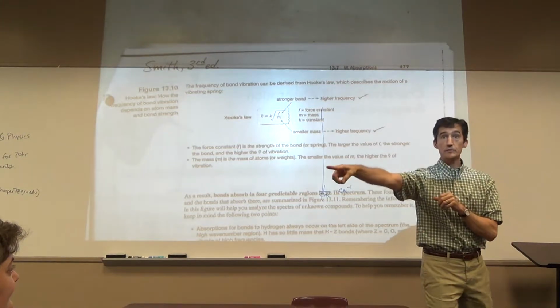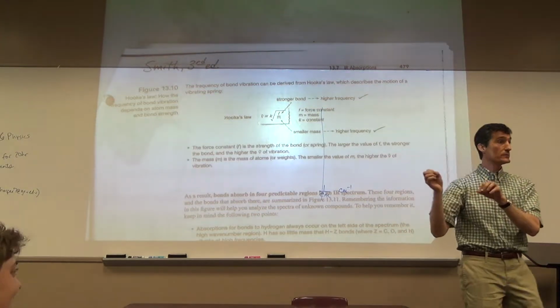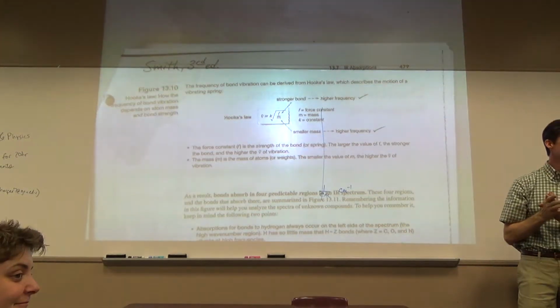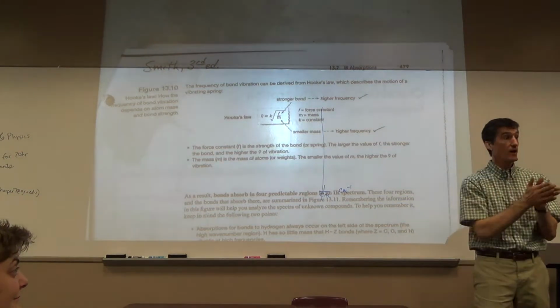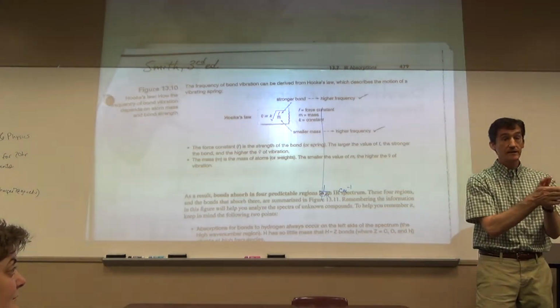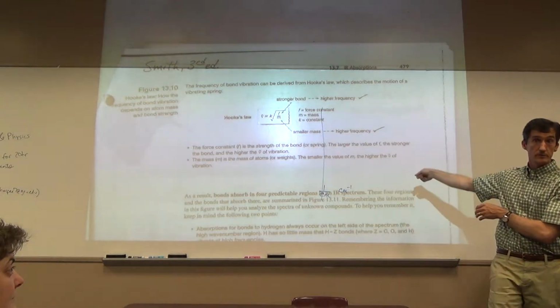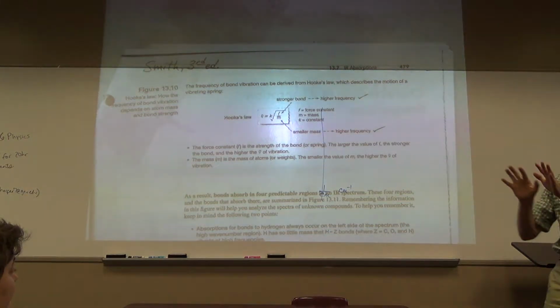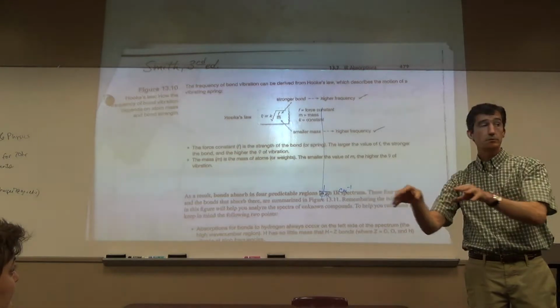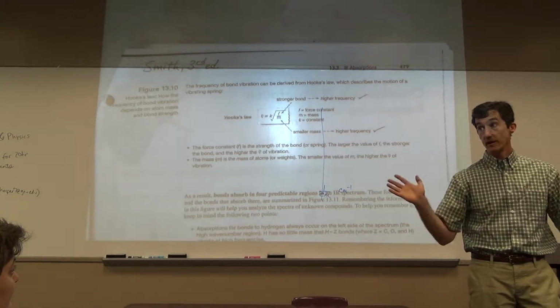Well, she's going to absorb because she likes fast light. I need to throw you some slower light for you to absorb. But eventually, as I scan the region, I will hit all the exact frequencies that you like, and you will all absorb. And I can plot all of those absorbances. That's what's going on with the IR. Even though I threw you a faster frequency and I threw you a slower frequency, still everybody got IR, because this is all IR.